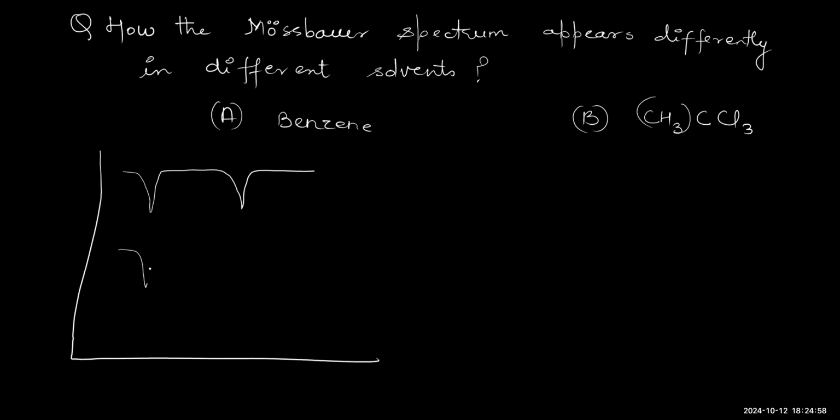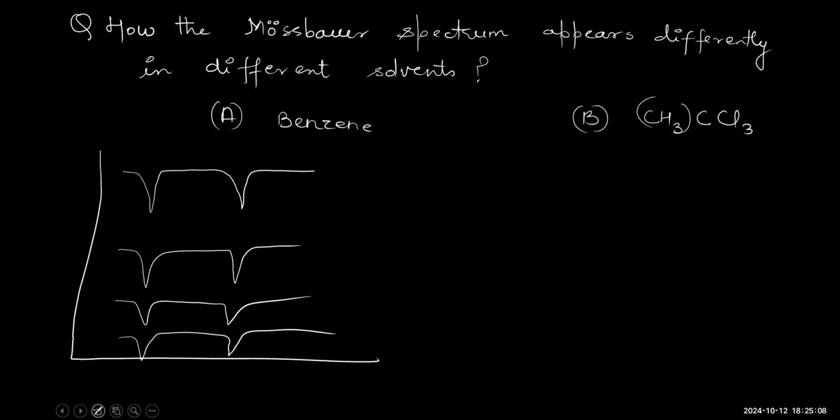Then again at the same position, three different temperatures, followed by, similarly, we also see iron 2 here. So you can consider it as a 2:1 ratio here; due to the limiting of space I can make it.